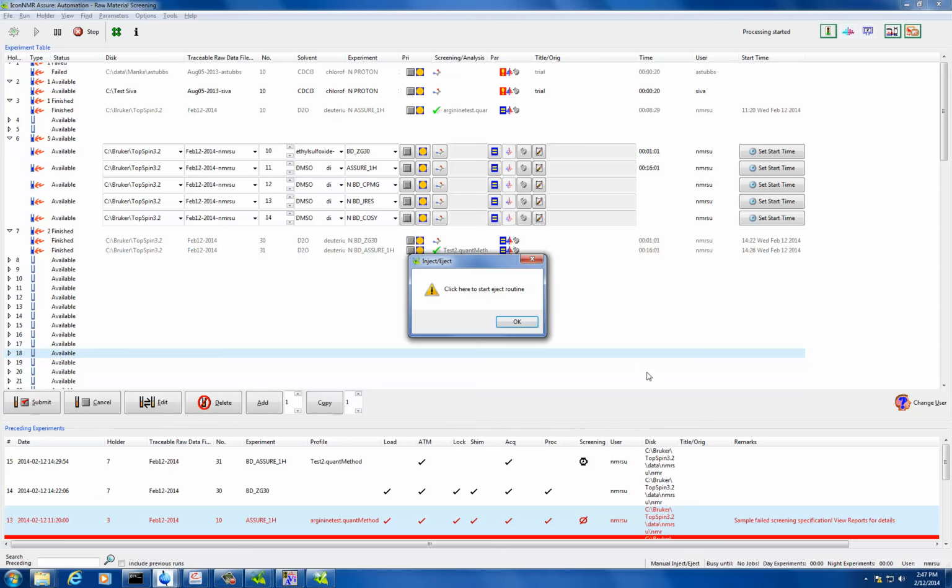Does it identify how much of each juice is present? If you had an unknown sample of juice, would it say it's 10% cranberry, 20% orange? Yes, it would tell you the concentrations of all the small molecule metabolites, and also what region the juice is from. It will tell you the mix as well.